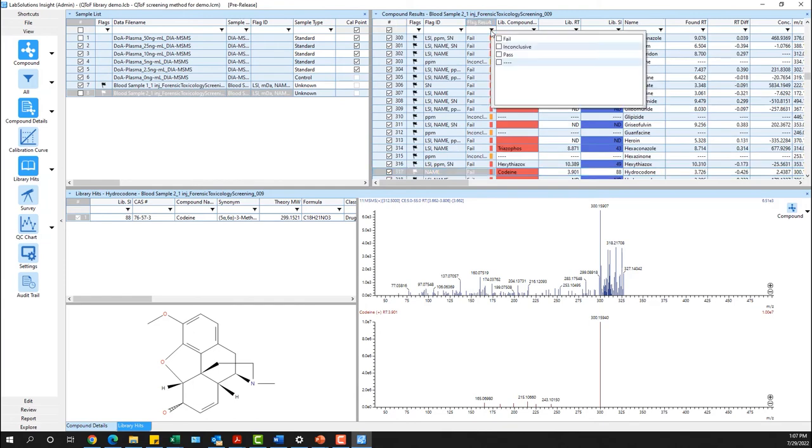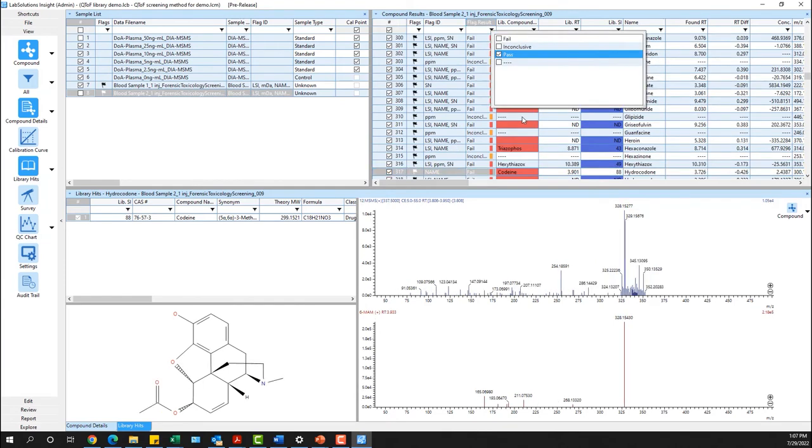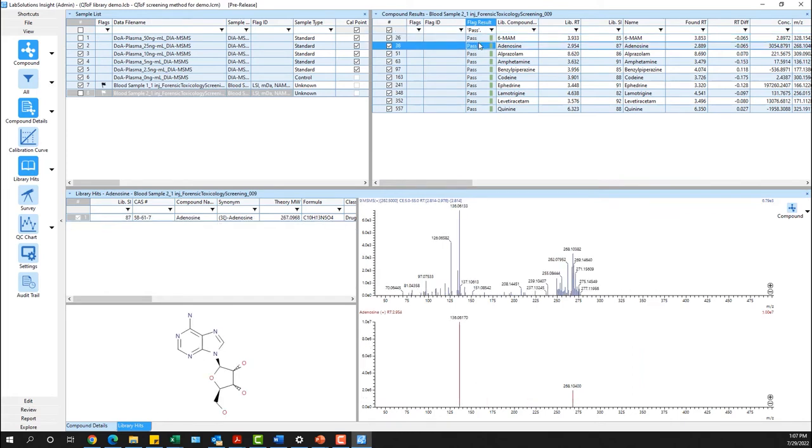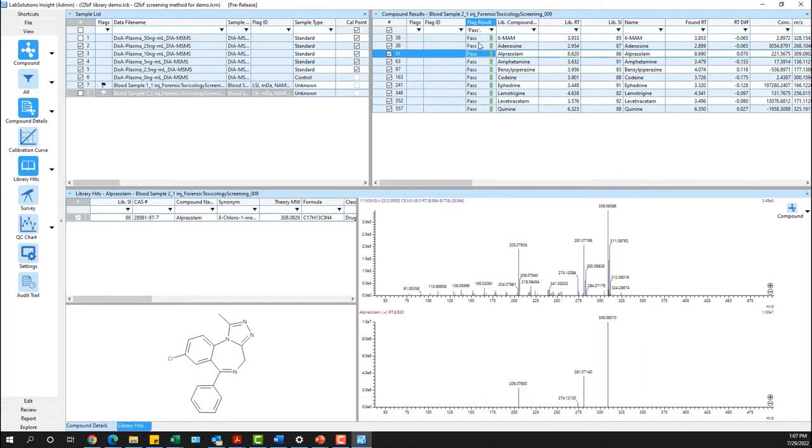Once flagged results have been generated, your sample results can now be filtered to display only the results that meet all the defined flagging criteria and are confirmed to have a library match.